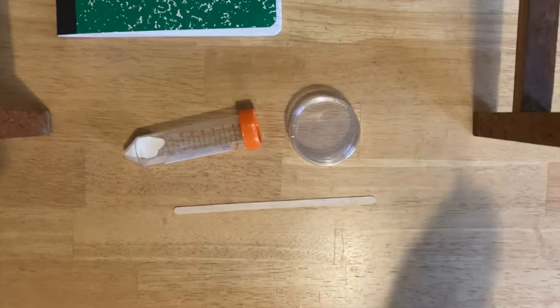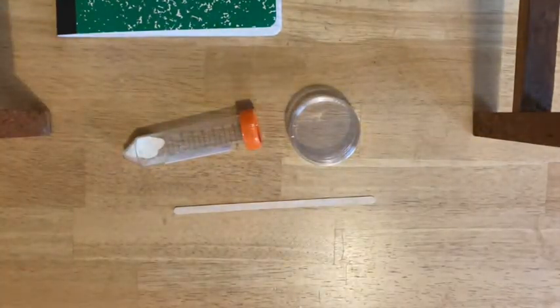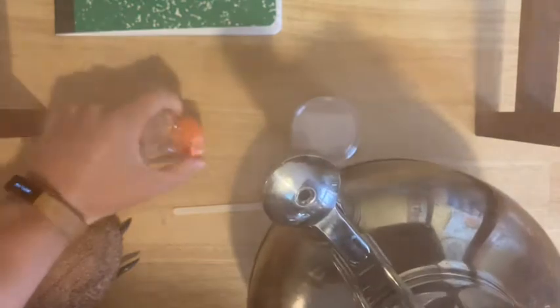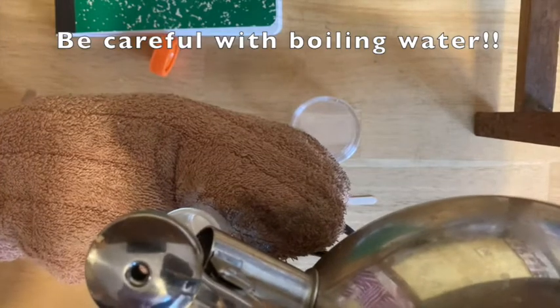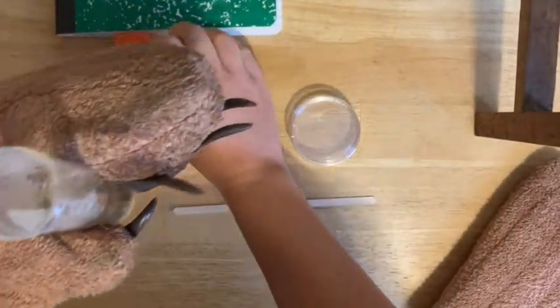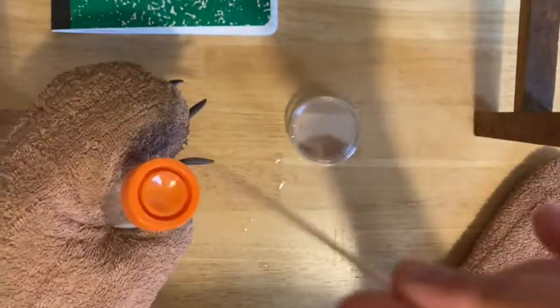The next thing you're going to do is add hot boiling water to your potato dextrose agar. Grab some hot hands or pot holders and boil some water. You may want to get some help with this step — be very careful with the hot water. Make sure you have your safety glasses on and heat protection. Fill this tube up to the 20 ml line carefully. Then cap it securely, invert it, shake it, invert it, shake it. If there are any clumps left at the bottom, use a wooden stir stick to swirl around in there and get it all mixed thoroughly. Make sure the water is really hot or it's not going to dissolve.